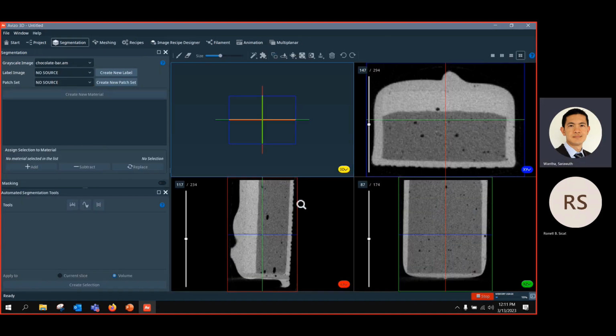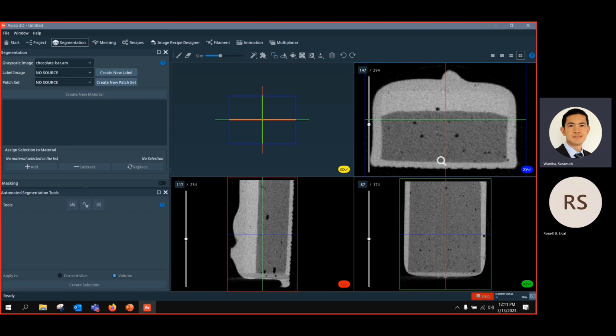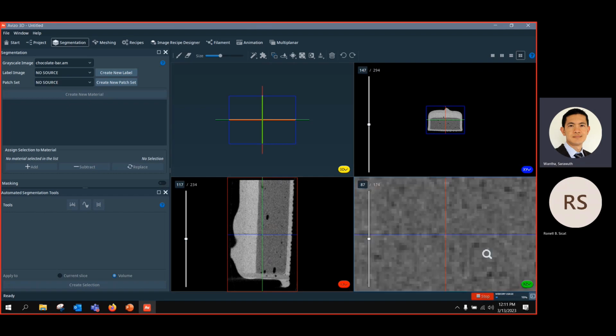Okay, what's new about this new Segmentation Plus workroom? As you can see, the interfaces are slightly similar, but now you can zoom in and zoom out easily. You don't have to browse to zoom in anymore, and the way you interact with the image is much faster than in the previous classic segmentation workroom.